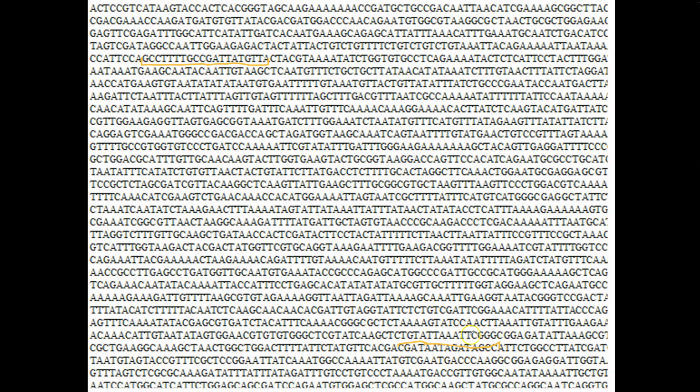So we can maybe identify small nucleotide sequences that are unique to that gene. That is sort of the key to PCR. So we don't actually isolate a gene away from others, but what we do is we can specifically make many copies of just that sequence. And so, the idea of primers, which these lines are supposed to indicate, is the key part.